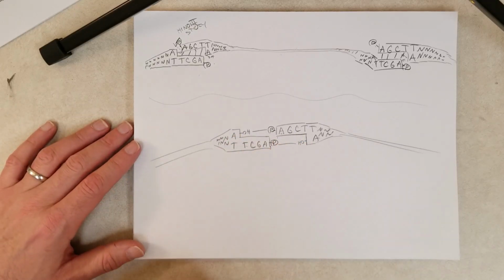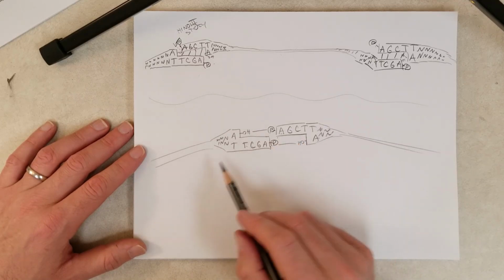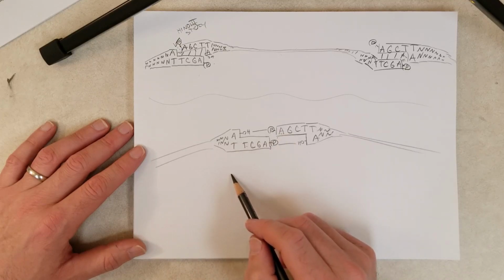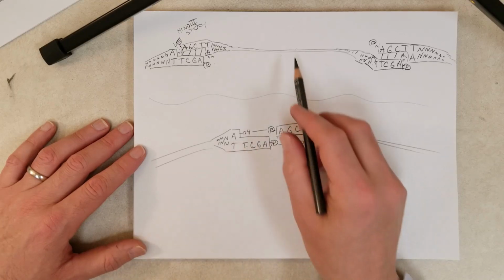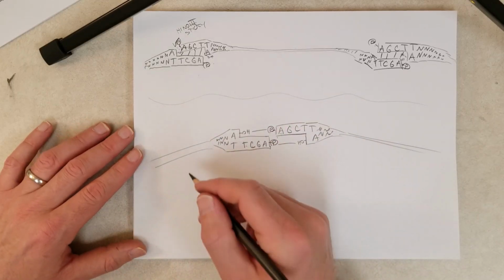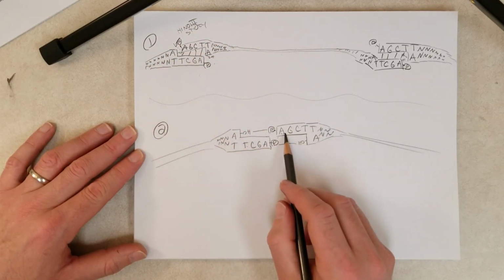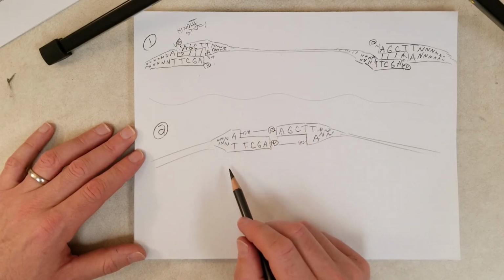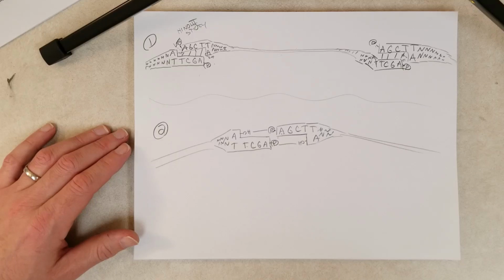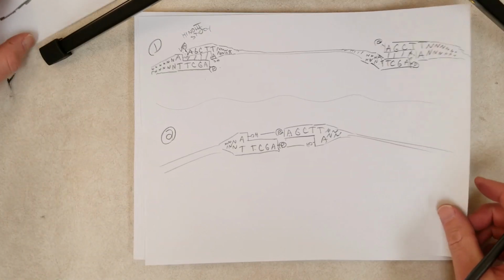Okay, so essentially the multiple cloning site was sealed back up. It's like we cut it with HindIII, opened up the multiple cloning site at the HindIII site, added ligase, and then it just closed back in on itself without the insert. So there are two possibilities here. One up here, the insert goes in. Two, the insert does not get in, and the multiple cloning site is reformed. It looks just like it looked before digestion with HindIII.